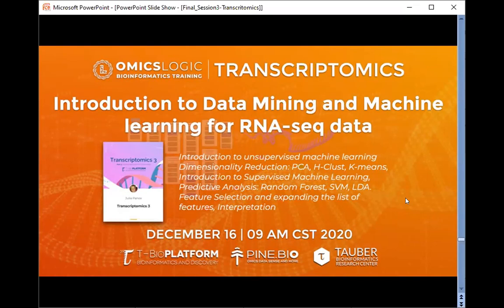Quantile normalization is usually considered a universal, platform independent normalization technique. Many studies recommend that, but depending upon the data, sometimes even Z-score normalization is also useful.